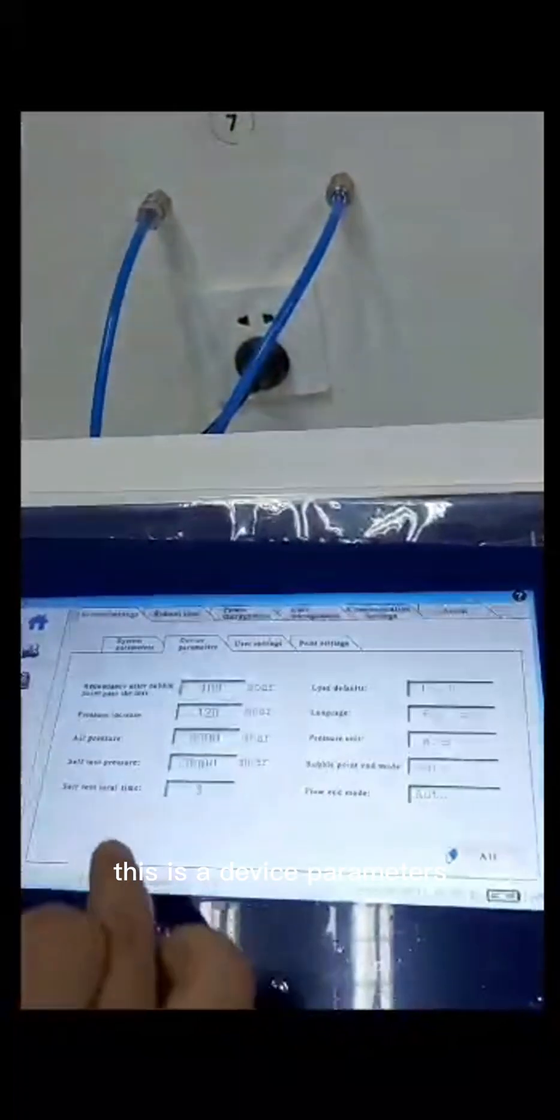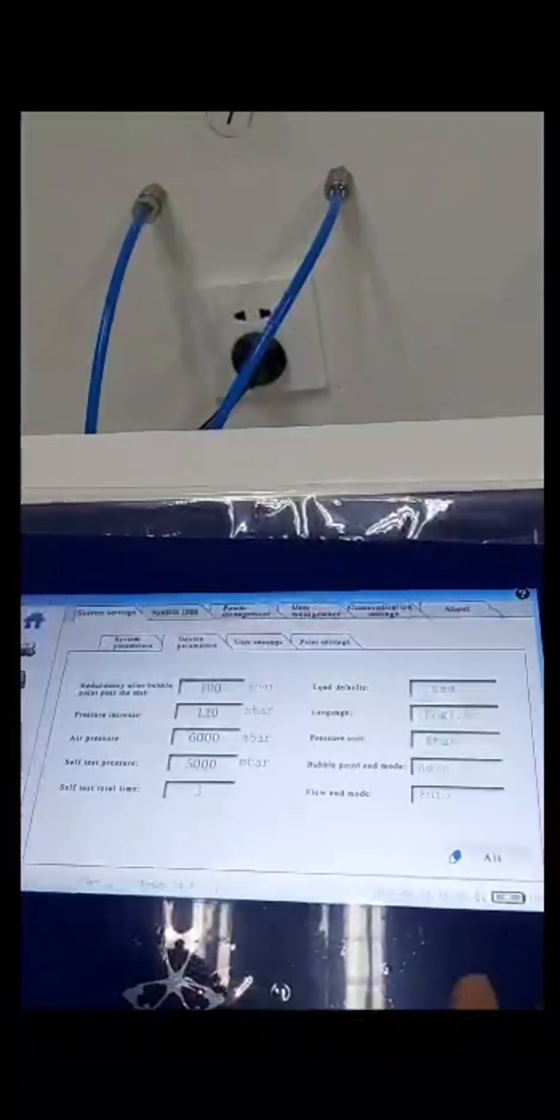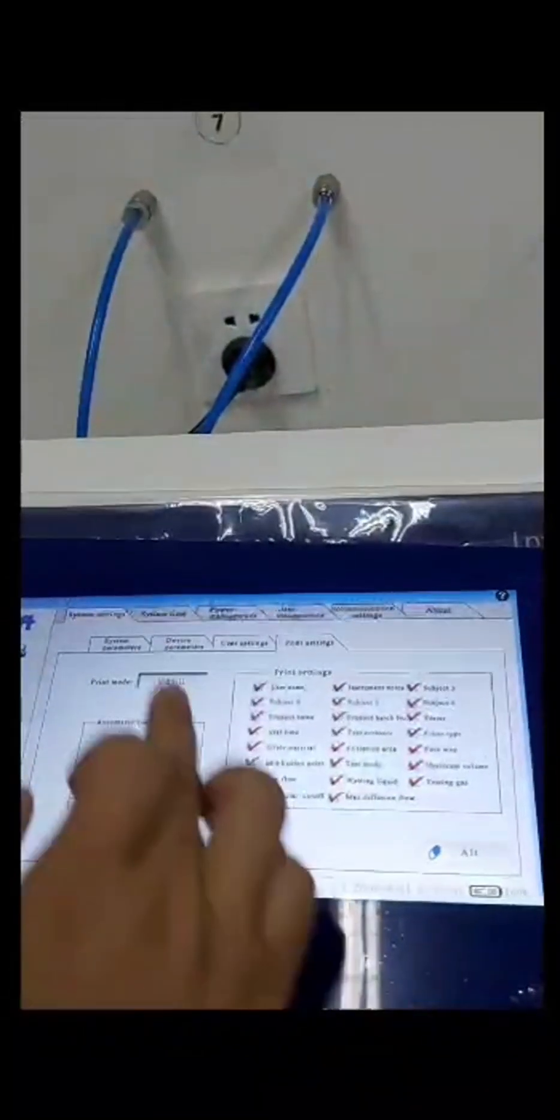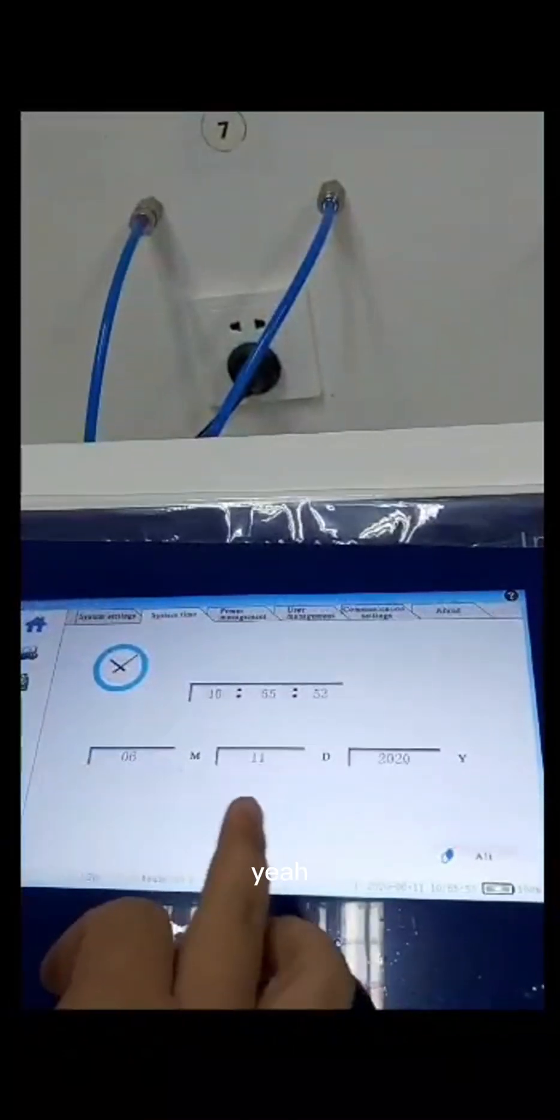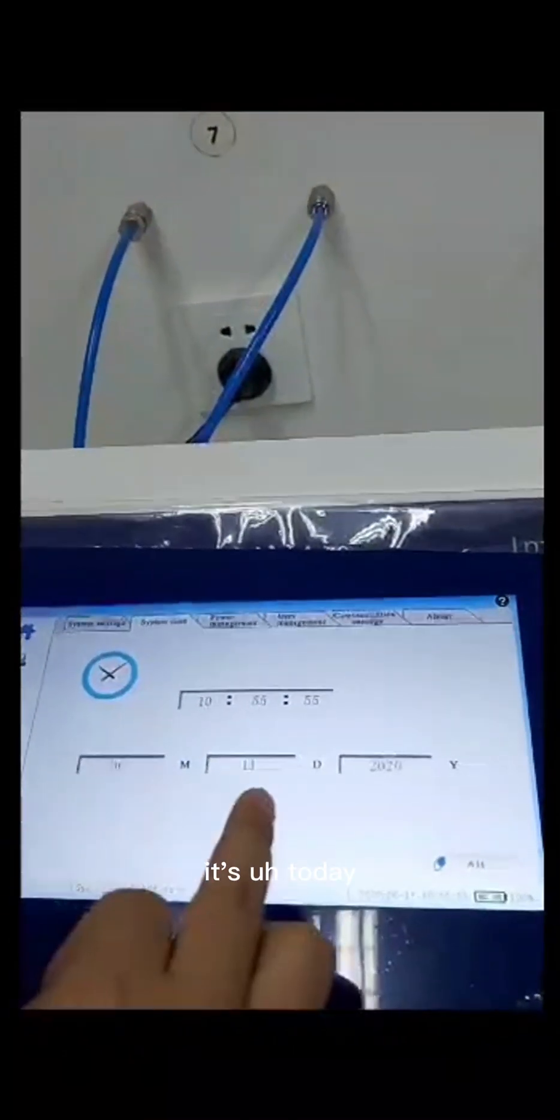This is device parameters. User settings, and print settings. System time. Is today.